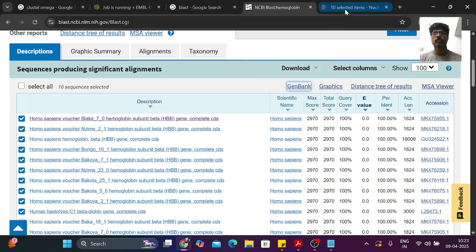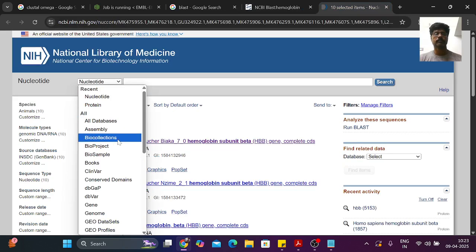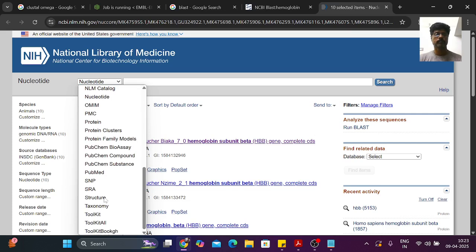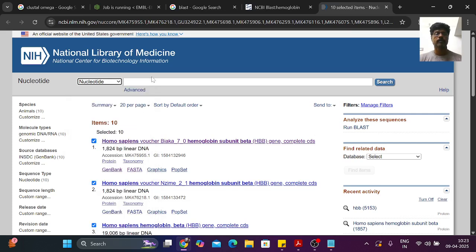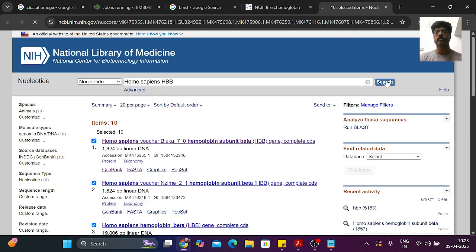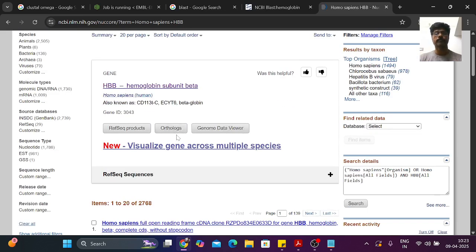Just go here and select nucleotide, right? So just give the nucleotide or gene, nucleotide, and we are working with the hemoglobin, right? HBB. So I will put HBB here and Homo sapiens hemoglobin. I will get search. See that this is familiar for you.